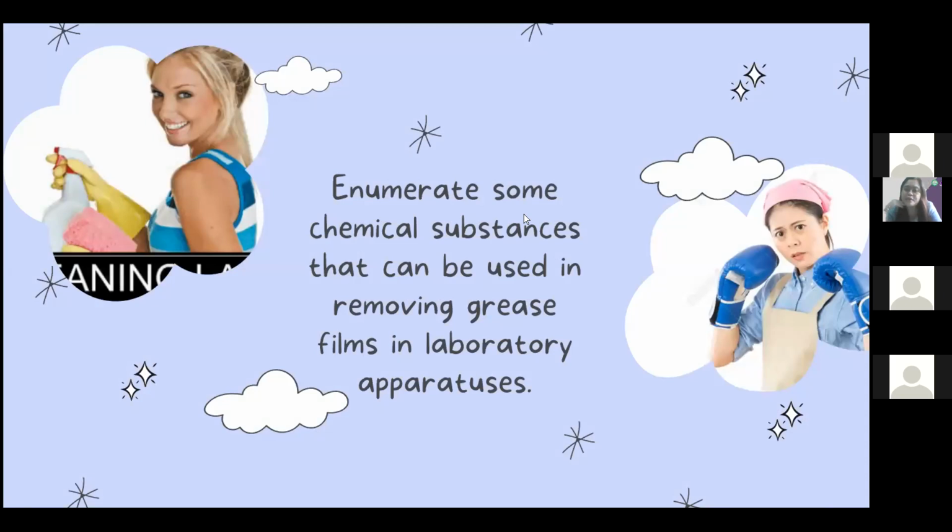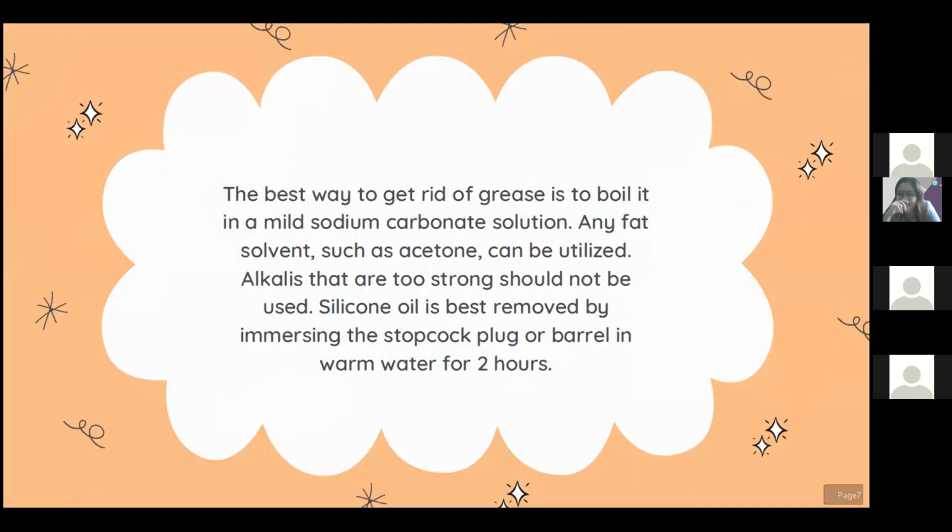Okay, enumerate some chemical substances that can be used in removing grease films in laboratory apparatuses. Actually, we have a lot for this. Okay, depende sa ginagamit natin na nag-cause ng grease sa ating laboratory apparatus. If kaya pa siya ng soap, kasi soap naman is merong polar and non-polar na sides. So kung kaya ng soap, then that is good.